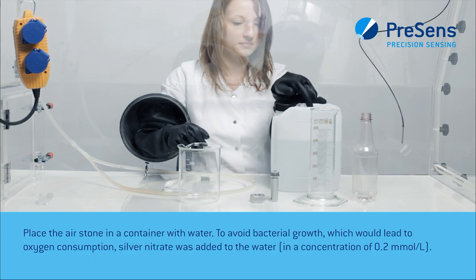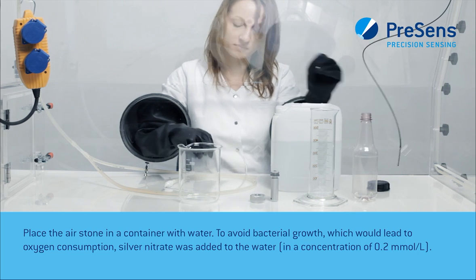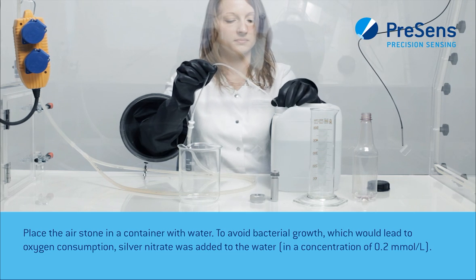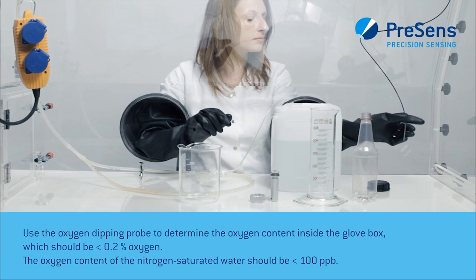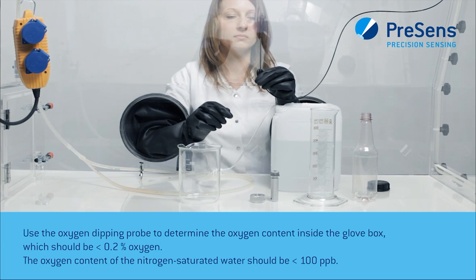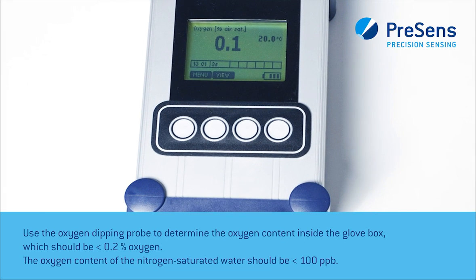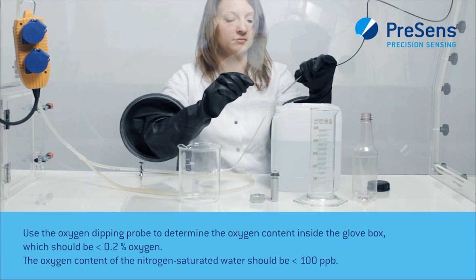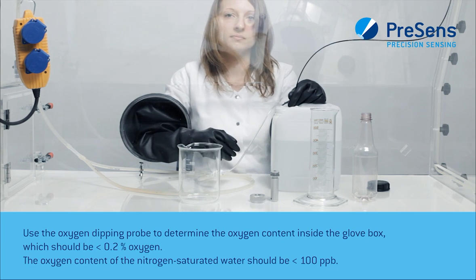Place the air stone in a container with water. To avoid bacterial growth, which would lead to oxygen consumption, silver nitrate was added to the water. Use the oxygen dipping probe to determine the oxygen content inside the glove box, which should be below 0.2% oxygen. The oxygen content of the nitrogen-saturated water should be below 100 parts per billion.